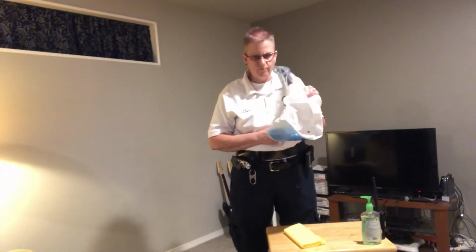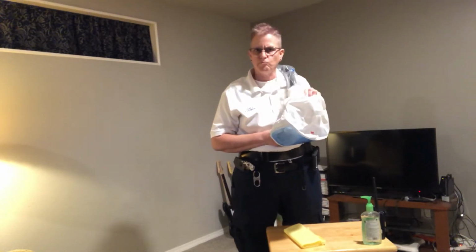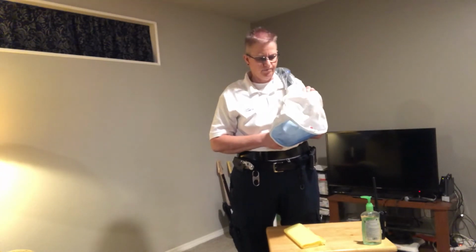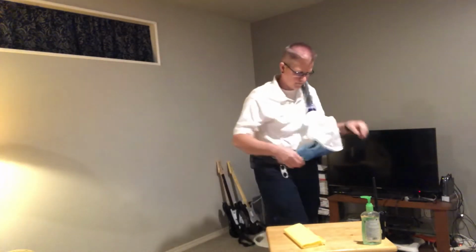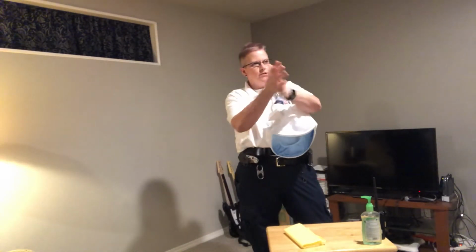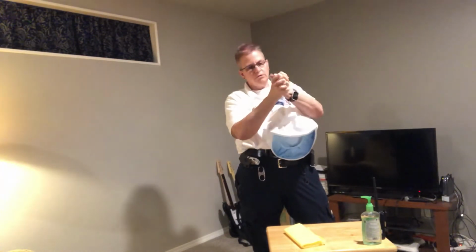Okay, so right now the PAPR is doing its self-check. It takes about 30 seconds, it's probably done. Yeah, good. So right now, before Jody does anything else, she's going to do some hand hygiene. Wash your hands, sanitizer. I did do that before I started touching. The more the merrier here. That's right. Dry my hands even more.